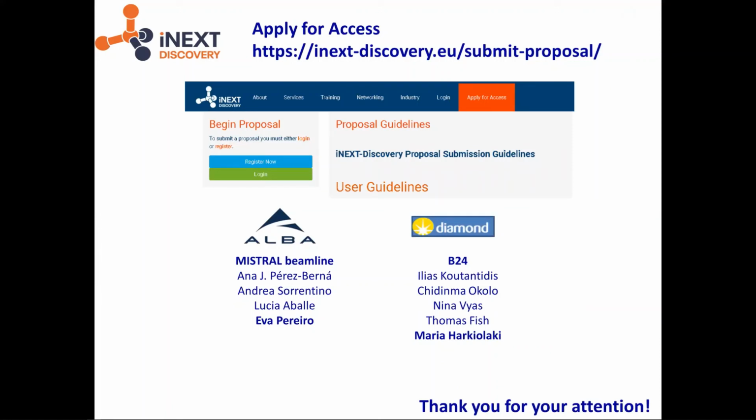And finally, before thanking you for your attention, just to remind you that 2 of the beamlines in this iNEXT-Discovery consortium are giving access to soft X-ray tomography, and this is the Mistral beamline where I'm working at ALBA, and also Diamond B24 where Maria Harkiolaki and her team also have a soft X-ray tomography beamline. And with this, I thank you for your attention.